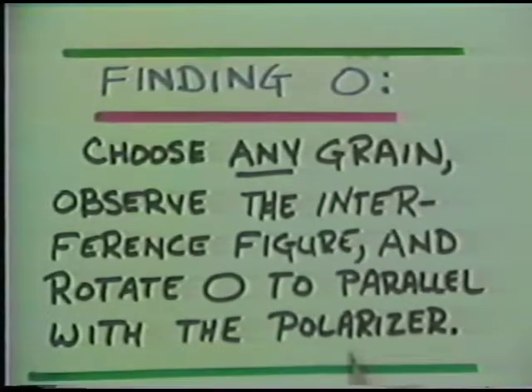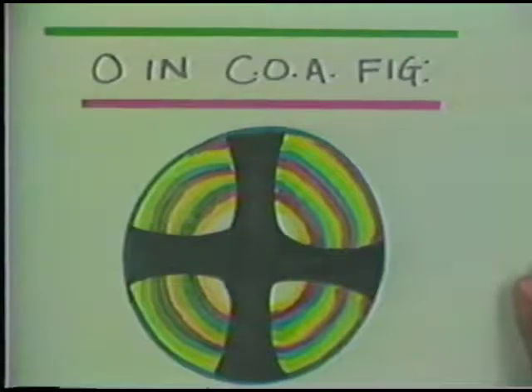Now, it depends on what kind of figure you have in order to find this kind of orientation. So let's go through the individual figures and review how the orientation procedure goes. First of all, what if you have a centered optic axis figure?